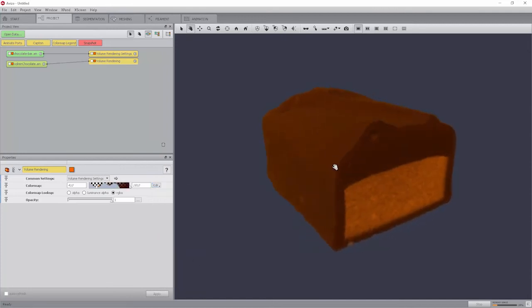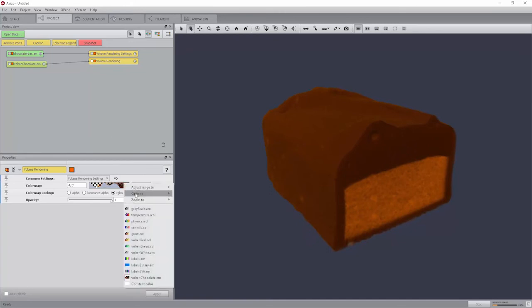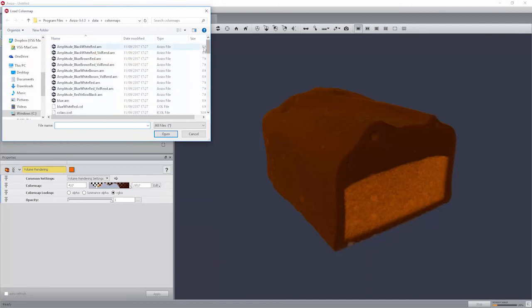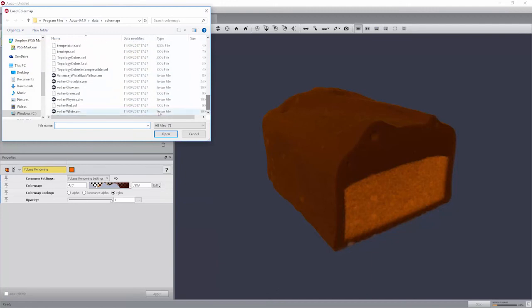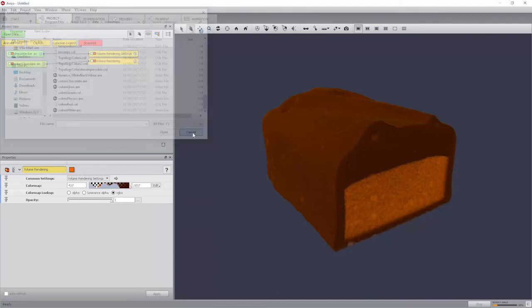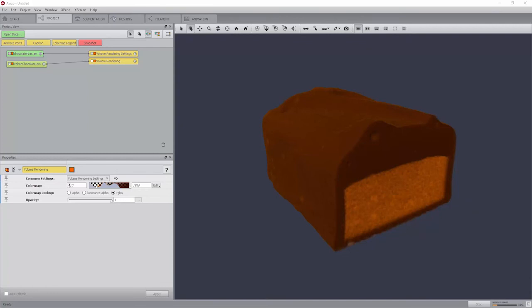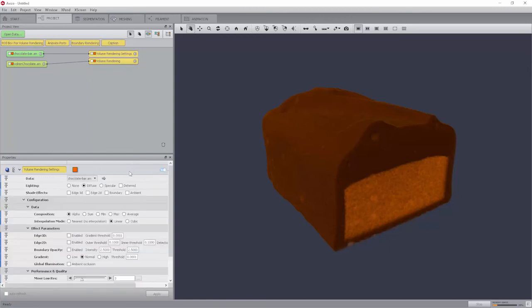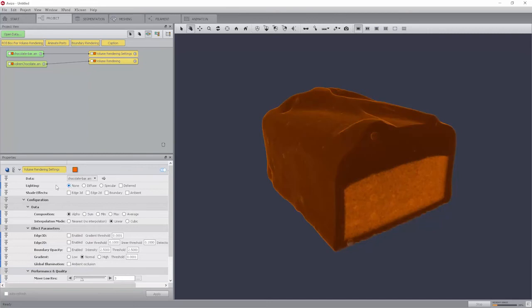If you don't have loaded the color map, you can still select it by clicking on edit, options, load color map. Set the range of the color map port of the volume rendering to 410, 1910. Select the volume rendering settings and change the lighting to none.